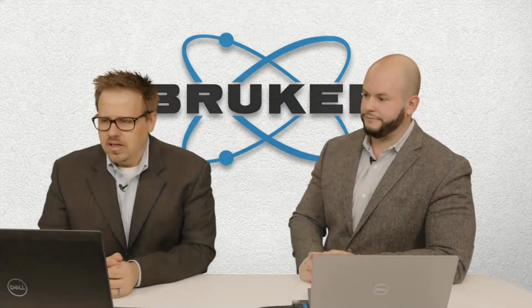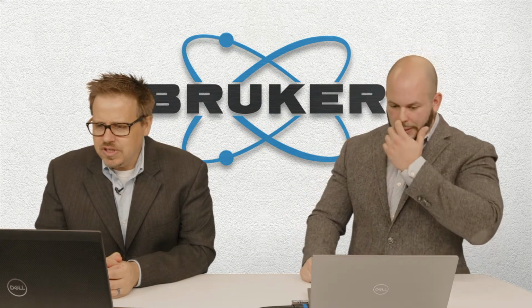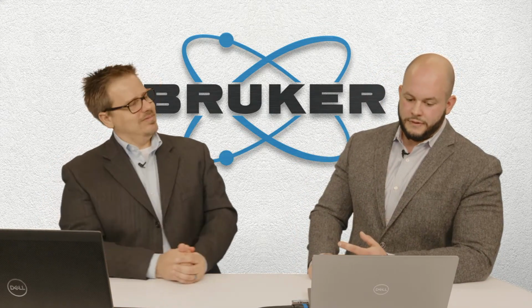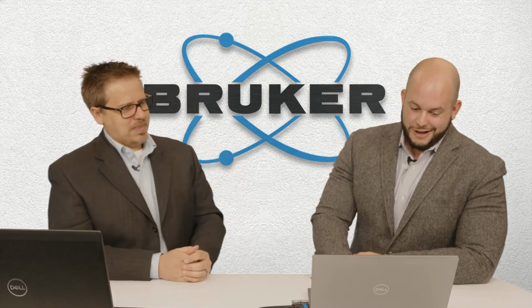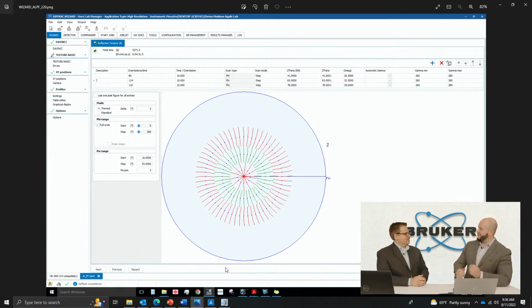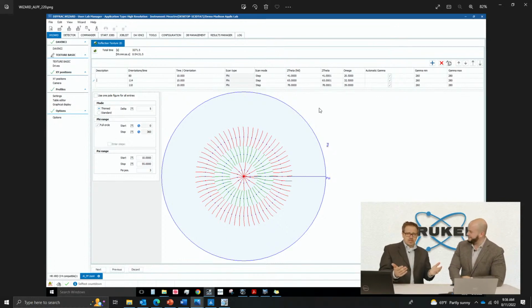The next question: can you explain how to set up a texture measurement in Wizard? Yeah, so if we go back to my Wizard example, it's pretty easy to do. I'm not in front of the instrument right now, so I can't do this live. This would be in your DIFFRAC.measurement software. You have all the tabs, and you just click on Wizard, and then you click File, New, and you can choose a texture. Yep, exactly. And then from there, what do we do?